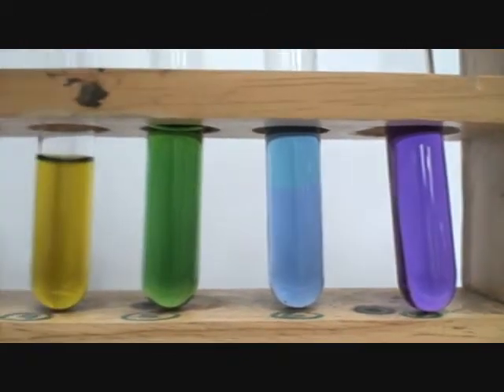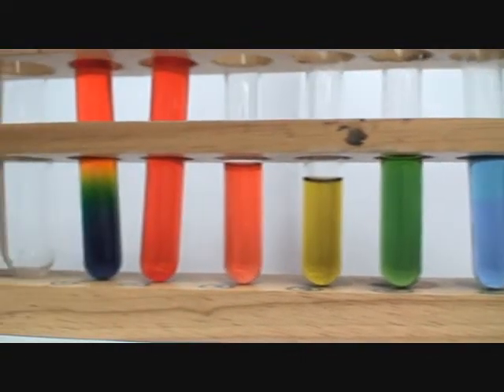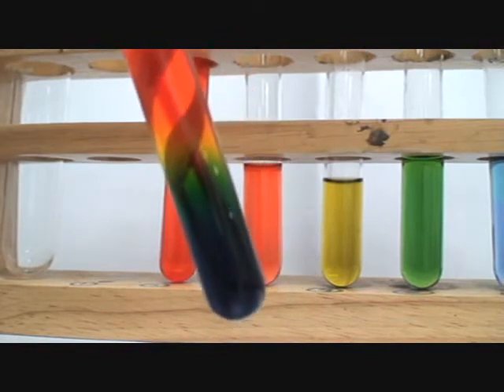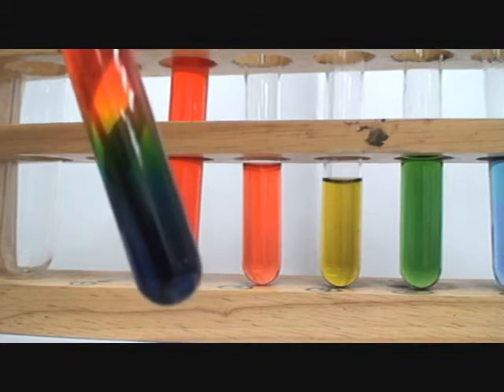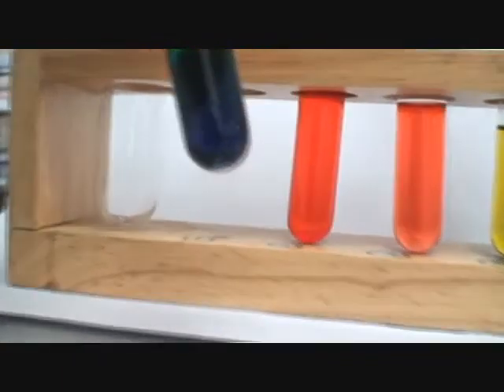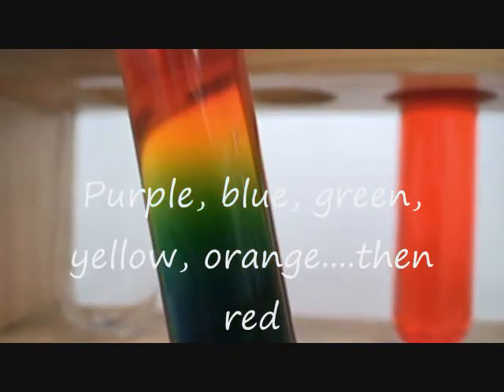These six test tubes were done by diluting. This last test tube was made differently: first we put sodium carbonate crystals into distilled water, then we add universal indicator and it turns purple. As you go up the line from purple, it goes to blue, to green, to yellow, orange, and then red.